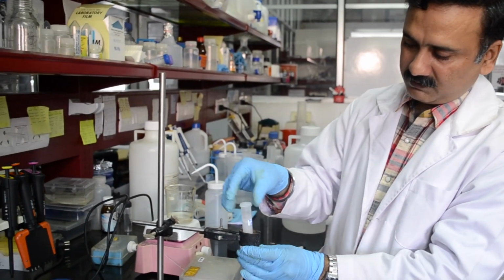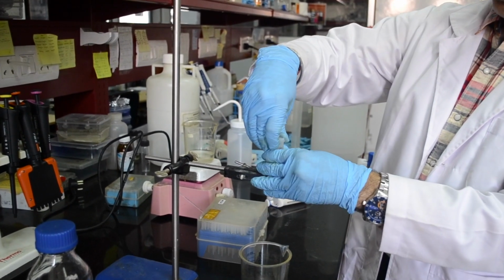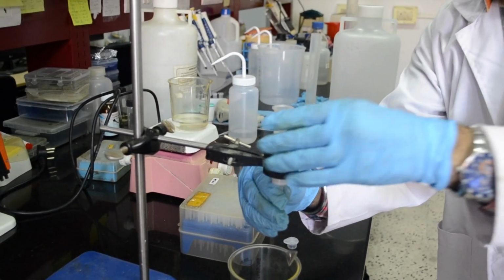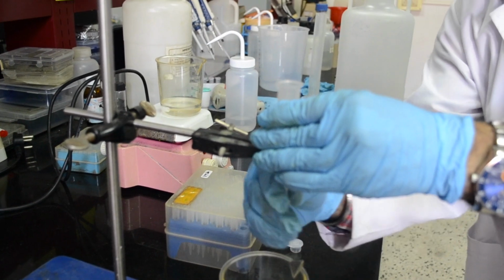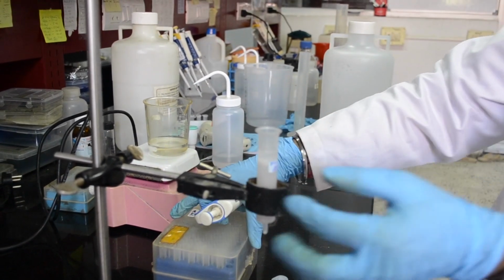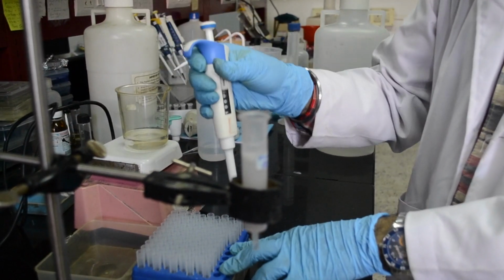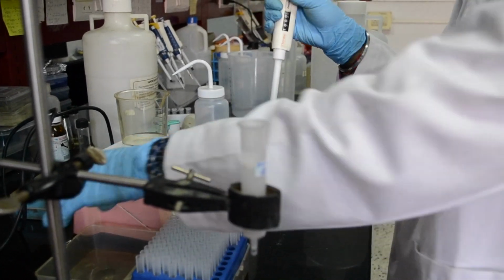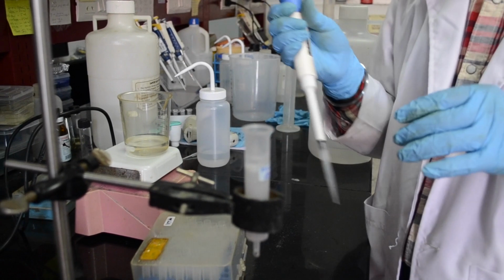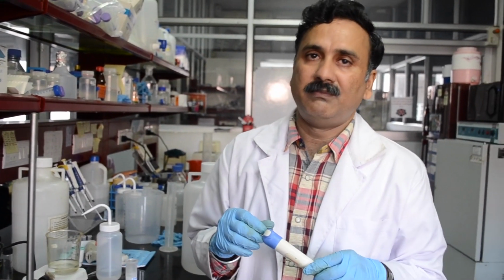First you have to fix your column into the stand, then remove the cap from the top, and then remove the lower end and let the column run. You see this level should come to the level of the disc, and then you can start pouring the buffer of your choice. This time we are running the column only in manual mode.